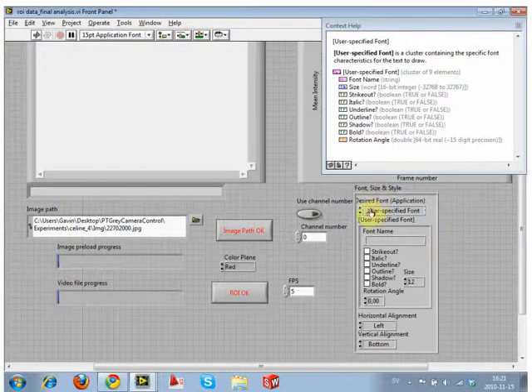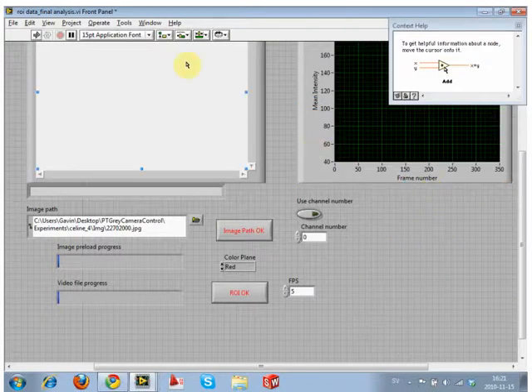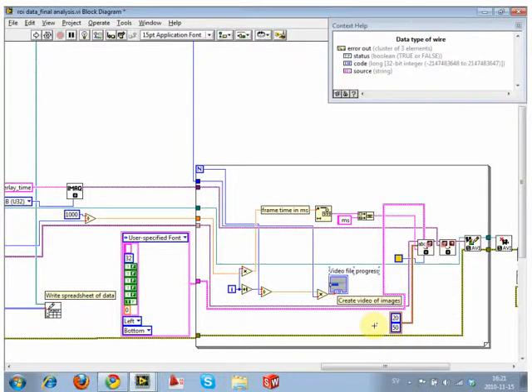Anyway, we don't need to see that. And then the other thing is the origin. And again, it's a little bit harder to know what it's going to be before you actually do it. Again, it's heavily dependent on your image size. You can set reasonable parameters. We can look at the image that's coming in here.